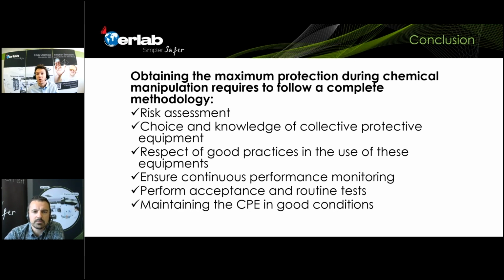Activated carbon works in a way that it will adsorb the different chemicals, the different molecules that are released inside the enclosure. And once the carbon is completely saturated, it means that all the different carbon particles have completely absorbed chemicals that are released into the enclosure. So what do you do with that afterwards? There are different companies which will incinerate them and use the energy of the incineration afterwards for other things, other practices in their company. So that's something that is done.